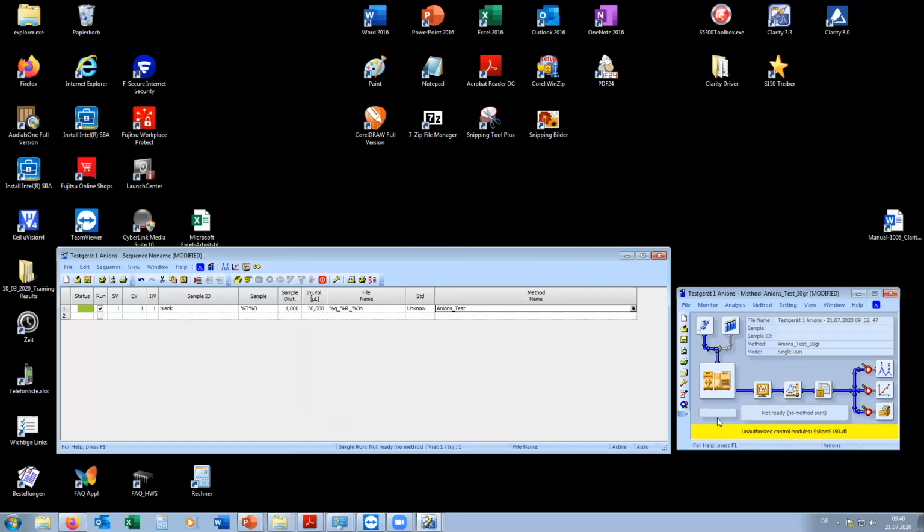Just 1 minute. Yeah. I have a question. Is the method the default setup, or do we need to create the method? I can give you method files for anions, cations, or basic applications. You don't have to create it, but after this, we also learn how to create a method. So I will show you that. Okay, so let's say this is my first sample in my sequence.